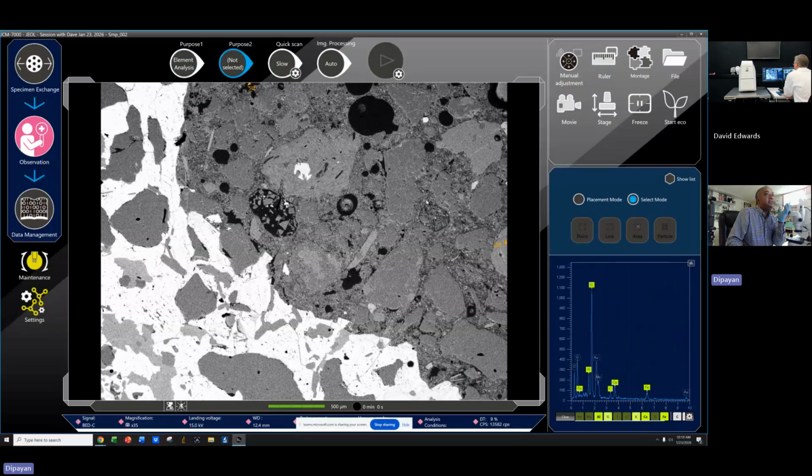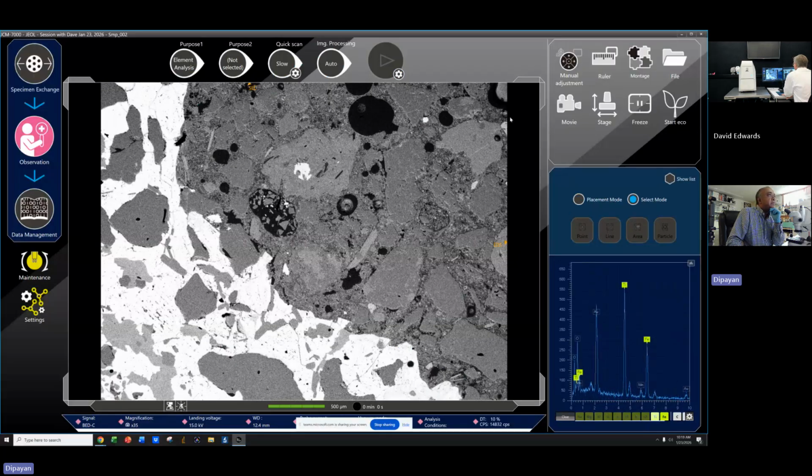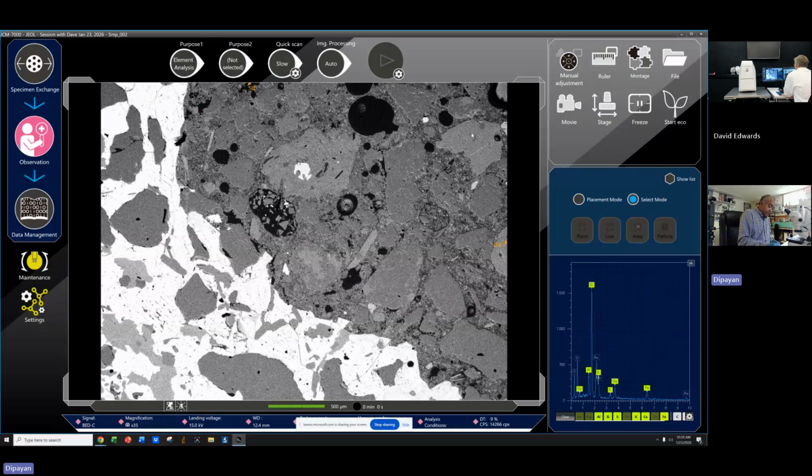So in the map analysis, I won't be able to get that. I have to come to the elemental analysis, because that quick survey is what I always have to do first. Yep. Before I decide, do I really care about the full-blown analysis? That's an ilmenite, iron titanium oxide. Okay, I got that idea. So I have to be in the elemental analysis, and I have to be in the select mode. That is where I was.